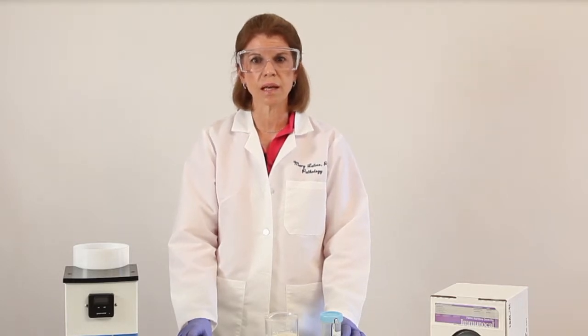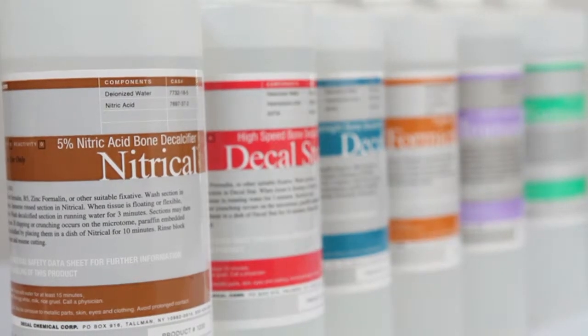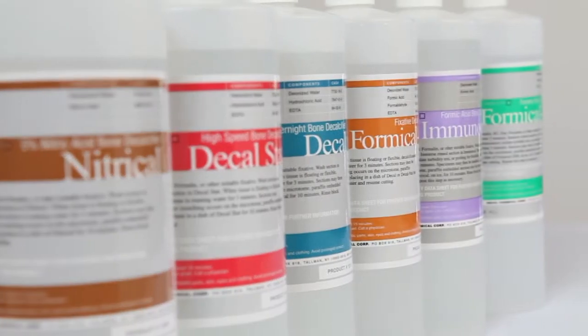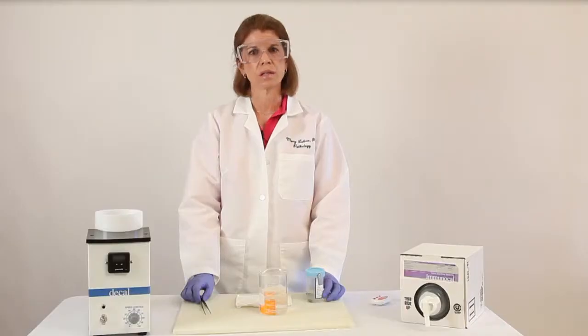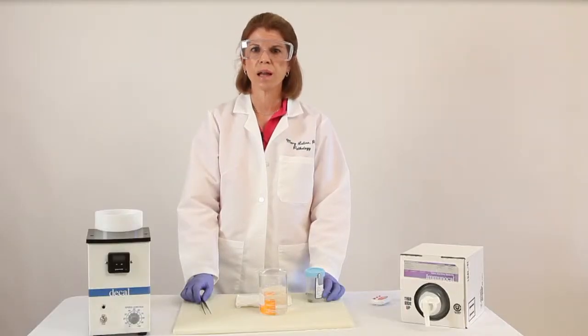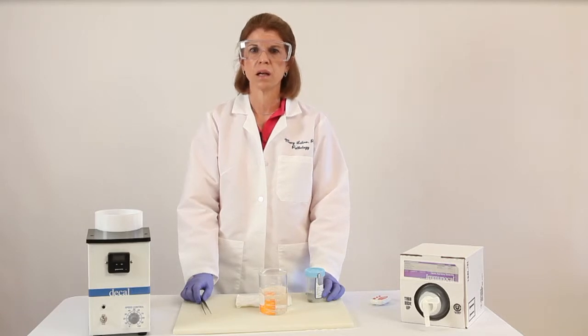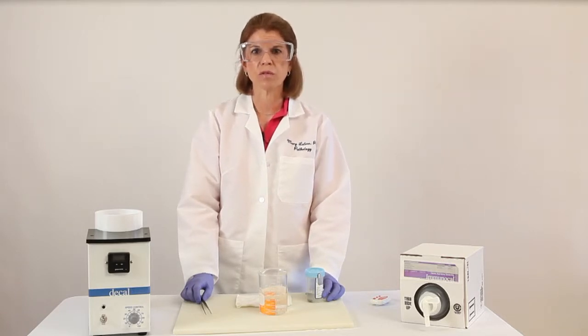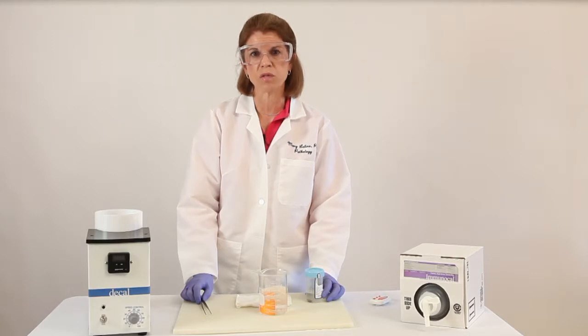Our lab stocks three different decalcification solutions from DeCal, so we can always choose the right one based on the type of tissue or bone to be sectioned, type of staining to be performed, and how quickly it needs to be done. You may need to experiment with different decalcification products to determine what's best for your laboratory. Your staining and processing procedures are specific for your lab, and your decalcification methods should be as well.